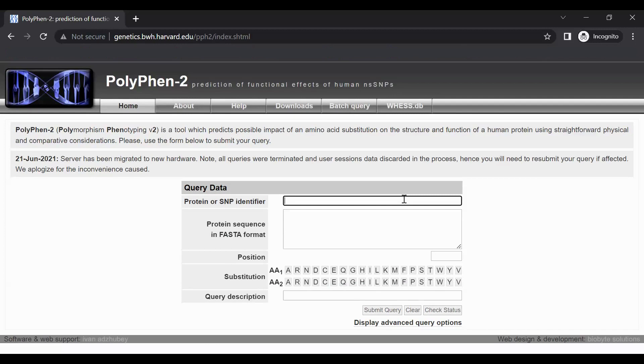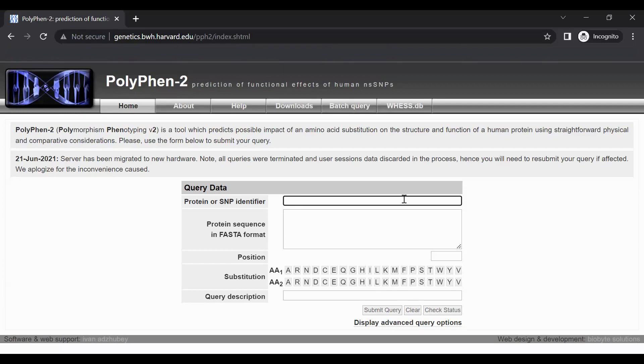In this tutorial, we will be looking at a variant in the human protein TAS receptor type 2 member 38, which is abbreviated TAS2R38, and which I will refer to as TASTER.